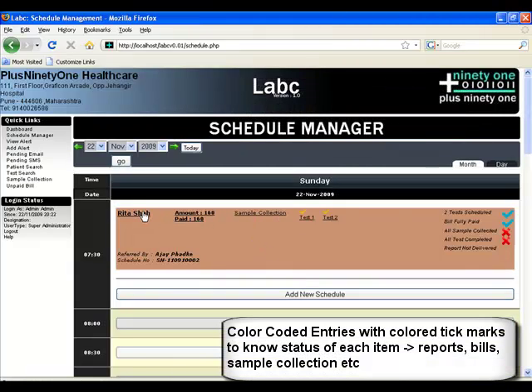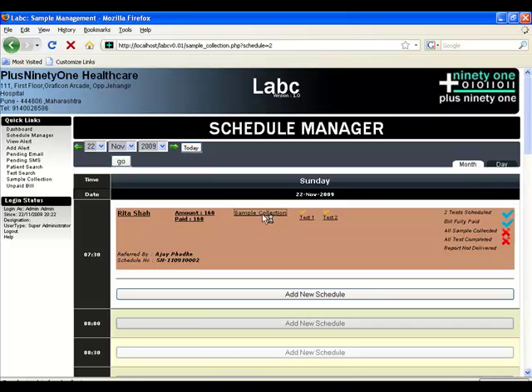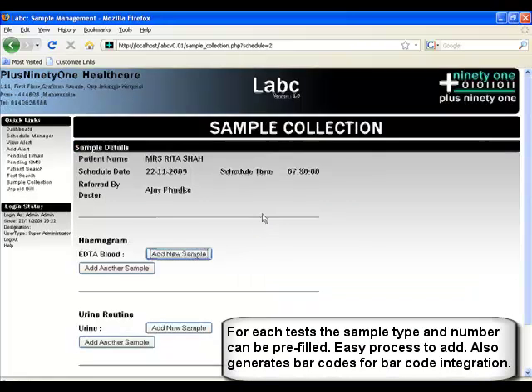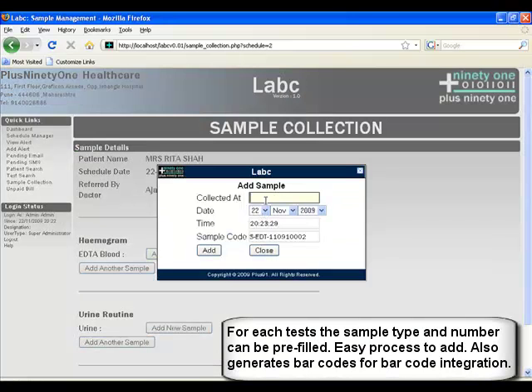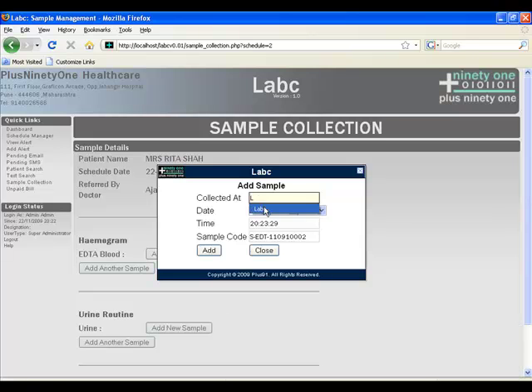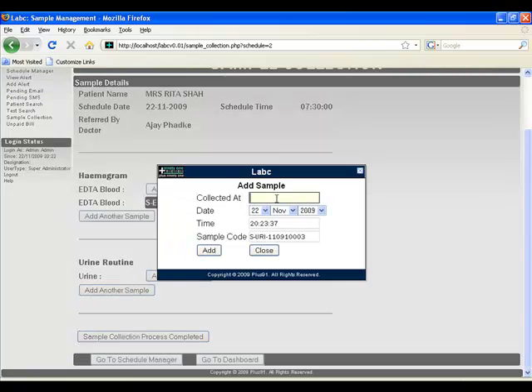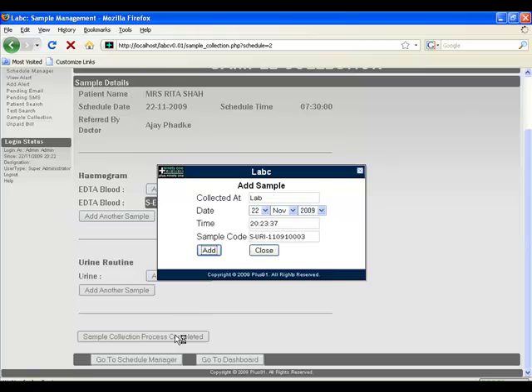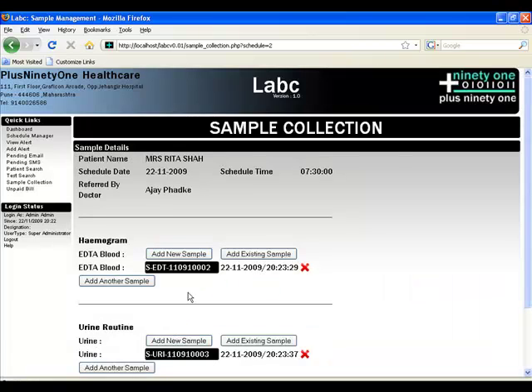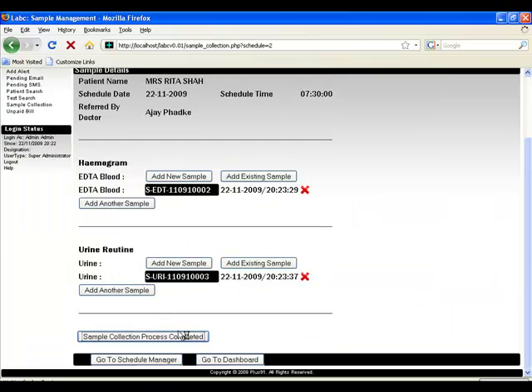SMS can be manual or automatic. The schedule manager comes with a very easy color-coded scheme which lets you know the exact status of the patient. The sample collection module is also present. You can enter the sample collected file, and it also creates barcodes which can be easily printed out and put on different vials and test tubes.